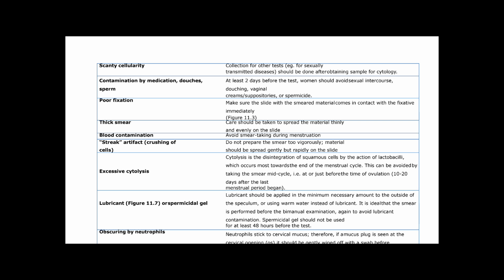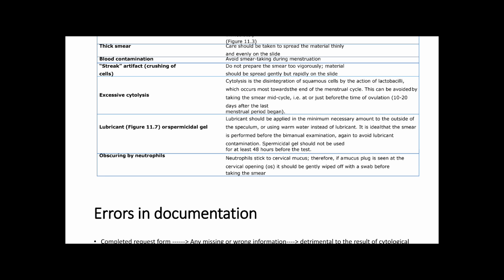Spermicidal gel should not be used for at least 48 hours before the test. Next one is obscuring by neutrophils. Neutrophils stick to cervical mucus. Therefore, if a mucus plug is seen at the cervical os, it should be gently wiped off with the swab before taking the smear.